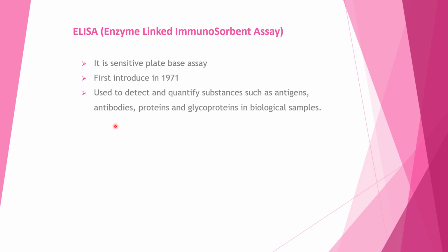What is the major use of this technique? This technique is used to detect and quantify substances such as antigens, antibodies, proteins, glycoproteins in different biological samples.